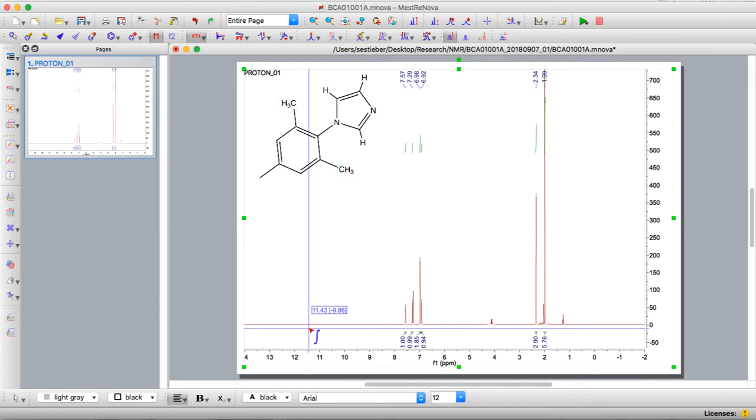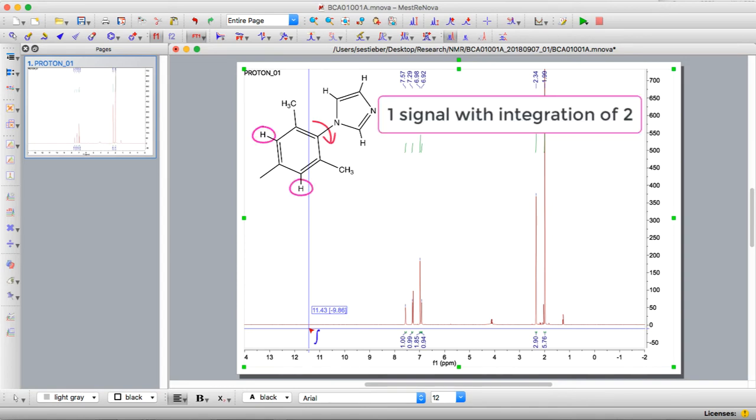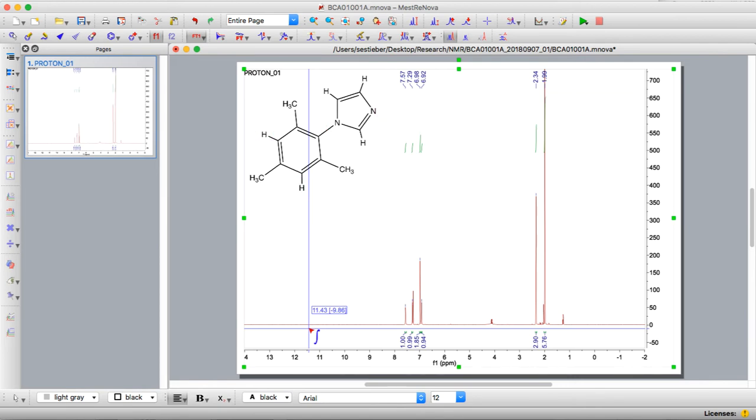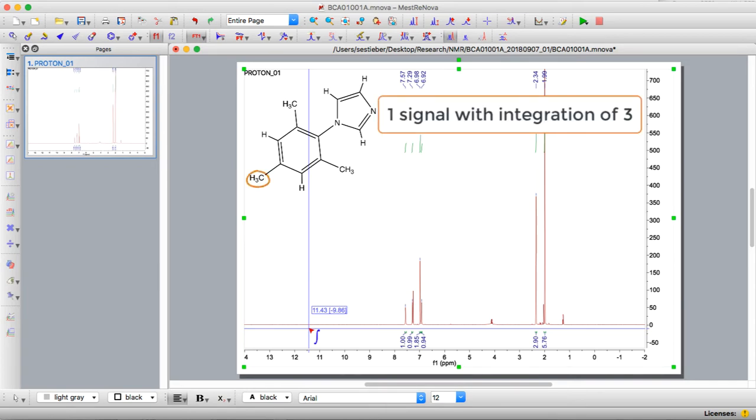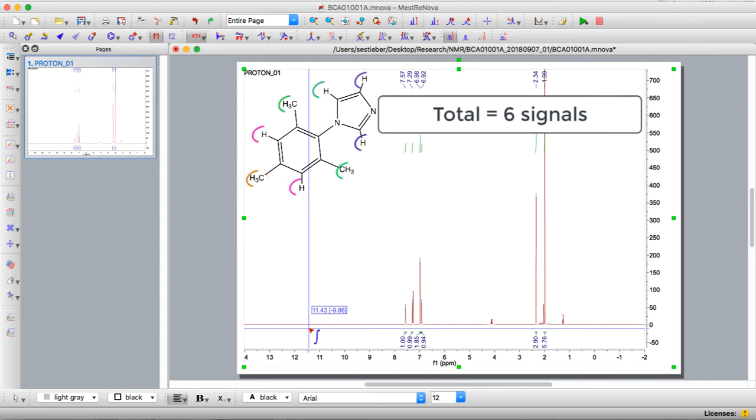If we move to the meta position there's one proton on each side. Again they're related through rotation so in total we expect one peak that has an integration of two. And then at the para position we have one methyl group which has three protons. So we expect one signal that has an integration of three. So total we expect six signals.